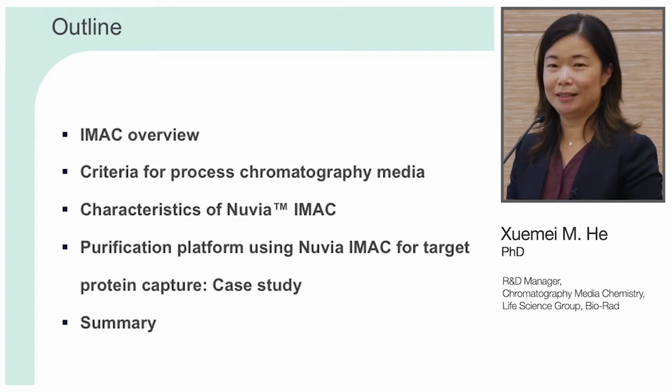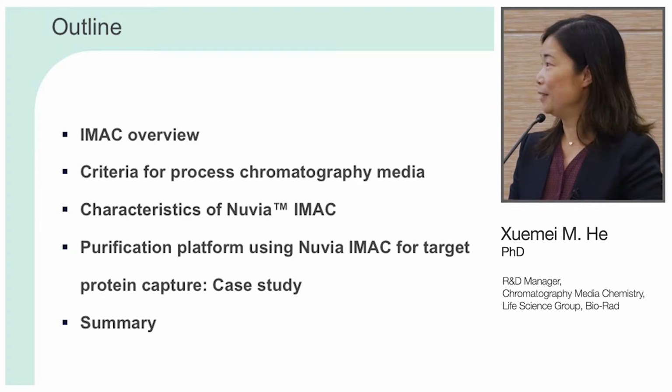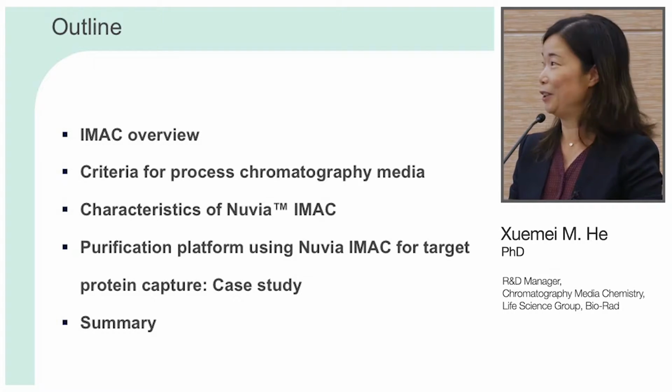So many of us, when we were in graduate school, more or less used IMAC for purification, because at that time, we only needed a small amount for activity tests or crystal structure. This week, we come here at BBI, we are talking about mass production of protein drugs. So I probably don't need to talk too much about IMAC, as you all know about this, so the overview will be really brief.